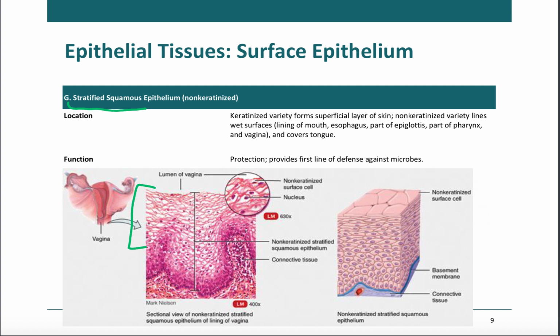Another thing about stratified epithelial tissue, stratified squamous epithelial tissue, is the layers are thick and there's always kind of a weird, darker, denser, rounder layer all the way at the bottom. So if the topmost layers are the most squished looking and it's all irregularly wavy squished, and the bottom's kind of darker, denser, and slightly rounder, that's the sign of stratified squamous.